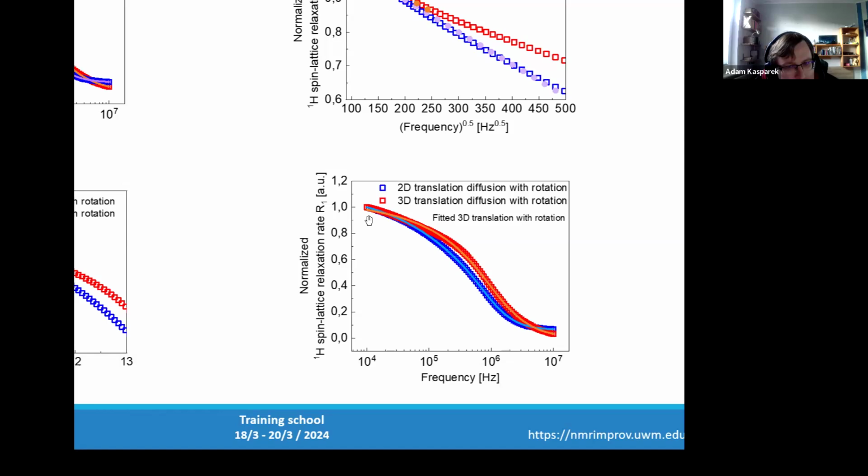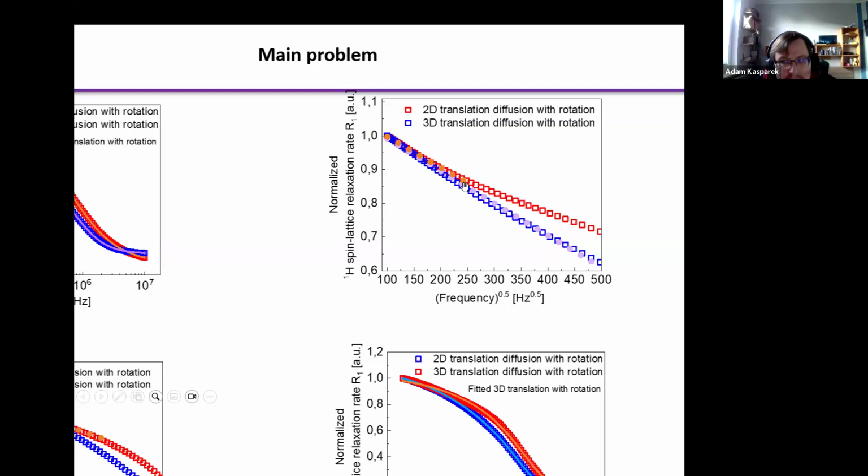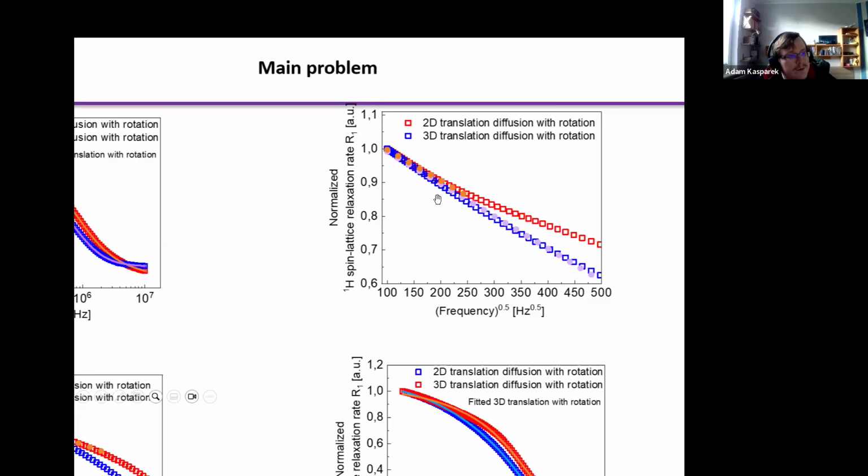What is interesting here is that these fingerprints are actually behaving a little better than the full sets, because the area of proportionality is much larger for the correct model. In this case, the right model, we expect linearity for the 3D translation diffusion. And as we can see, this diffusion, I don't know, do you see my cursor or not?